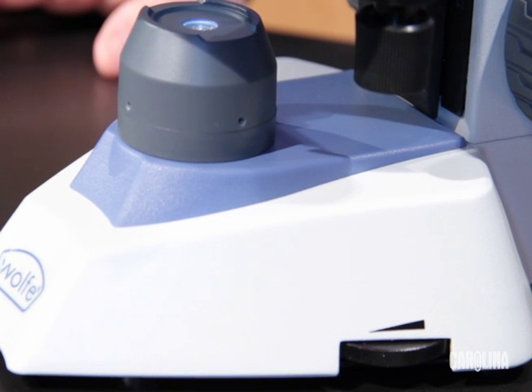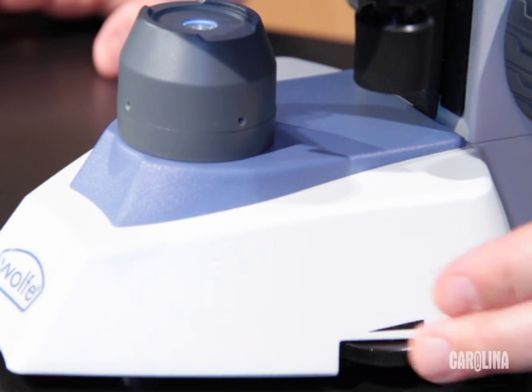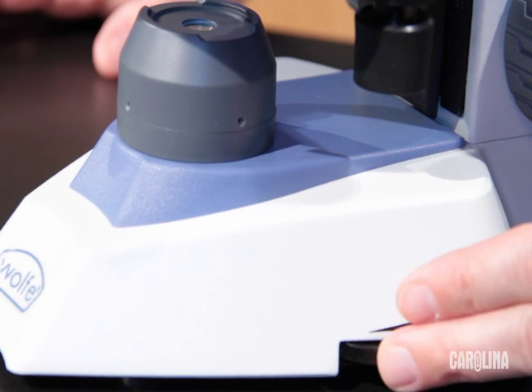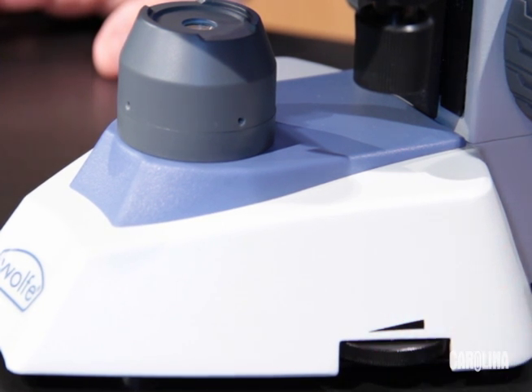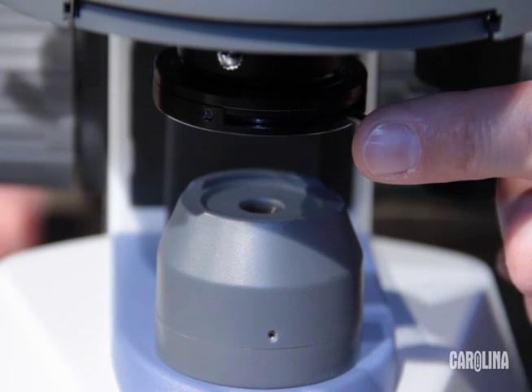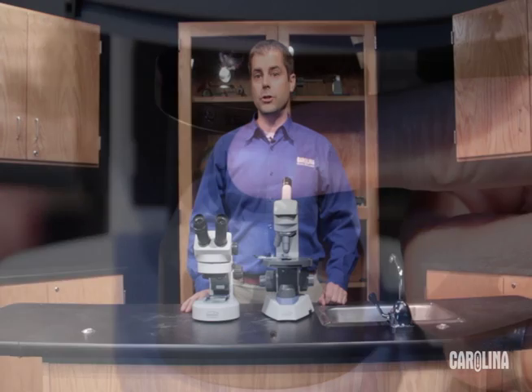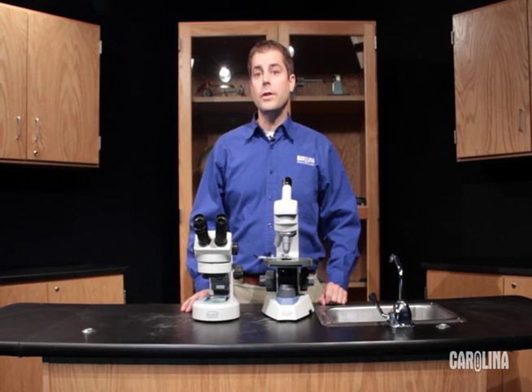First dial the dimmer to its lowest setting. You'll use low light levels when starting out because the lower objectives are bright and less light is needed. Then adjust the disc or iris diaphragm to regulate the amount of light coming through the stage. Start with a less open aperture with low power objectives.